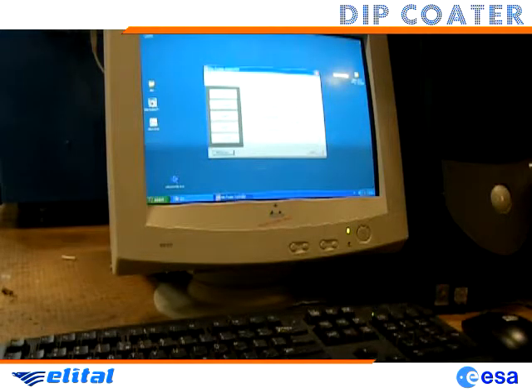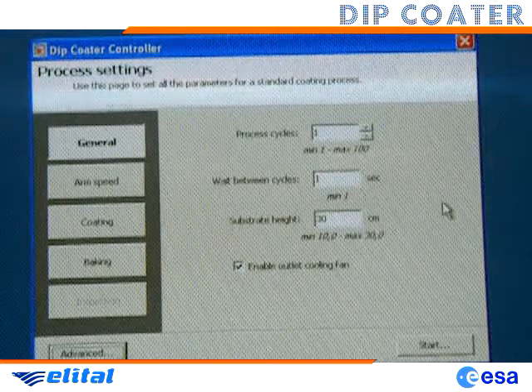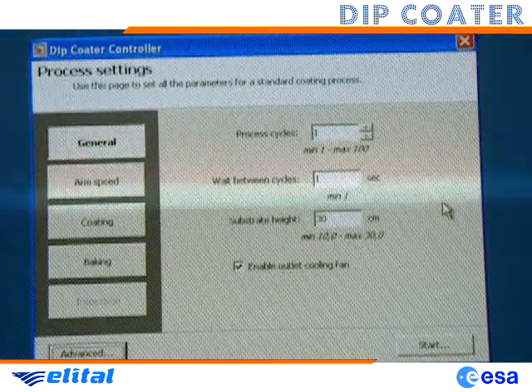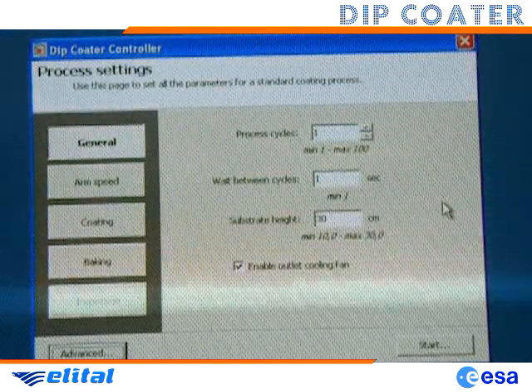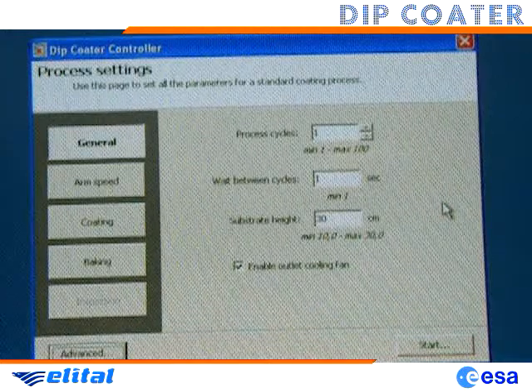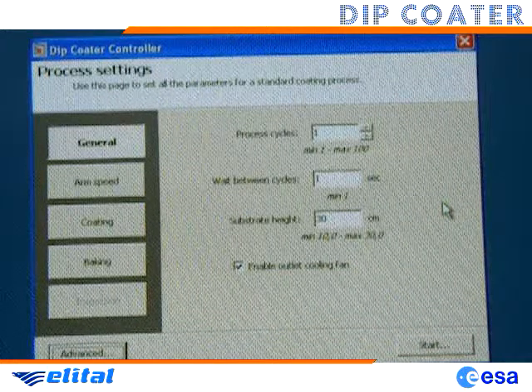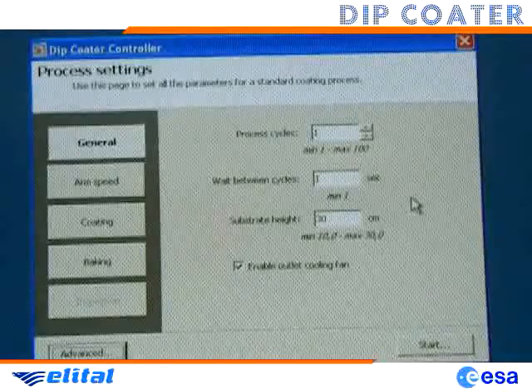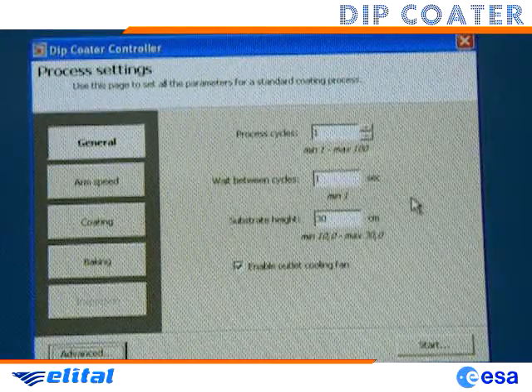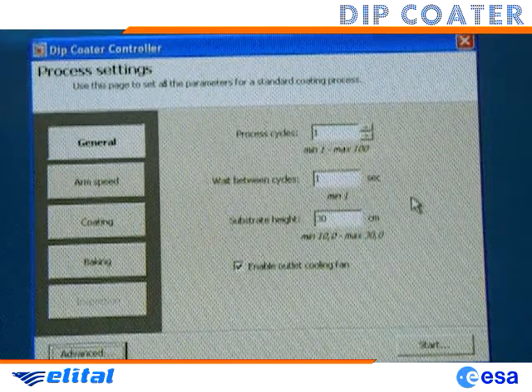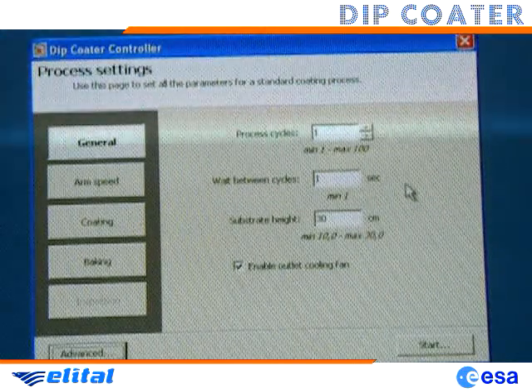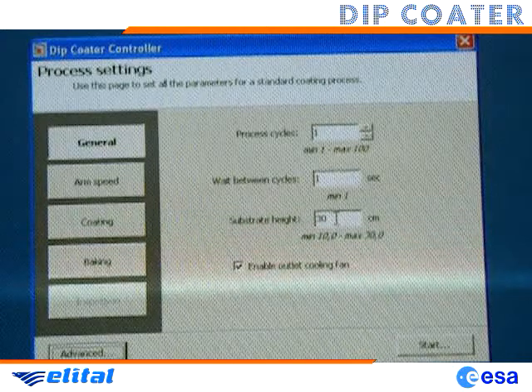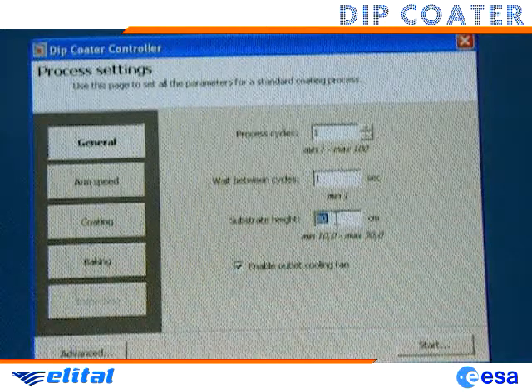We are now setting up a test coating process. This is the basic process configuration window of the Dip Coater Controller software, shown as it appears in the first execution. For a single cycle process, we only have to set the height of the substrate. In this example, we can leave the default value of 30 cm.